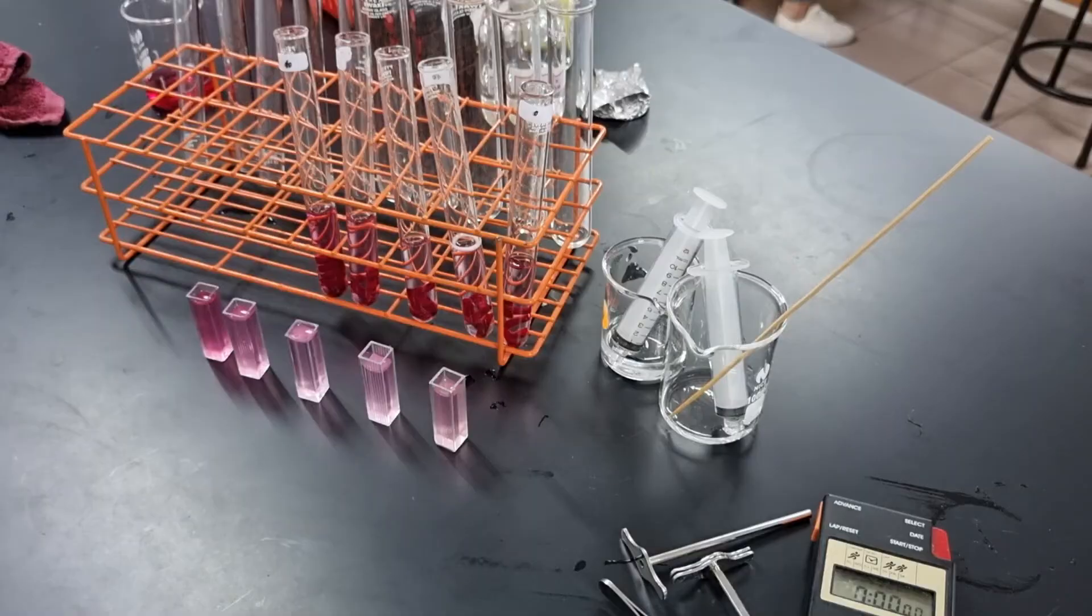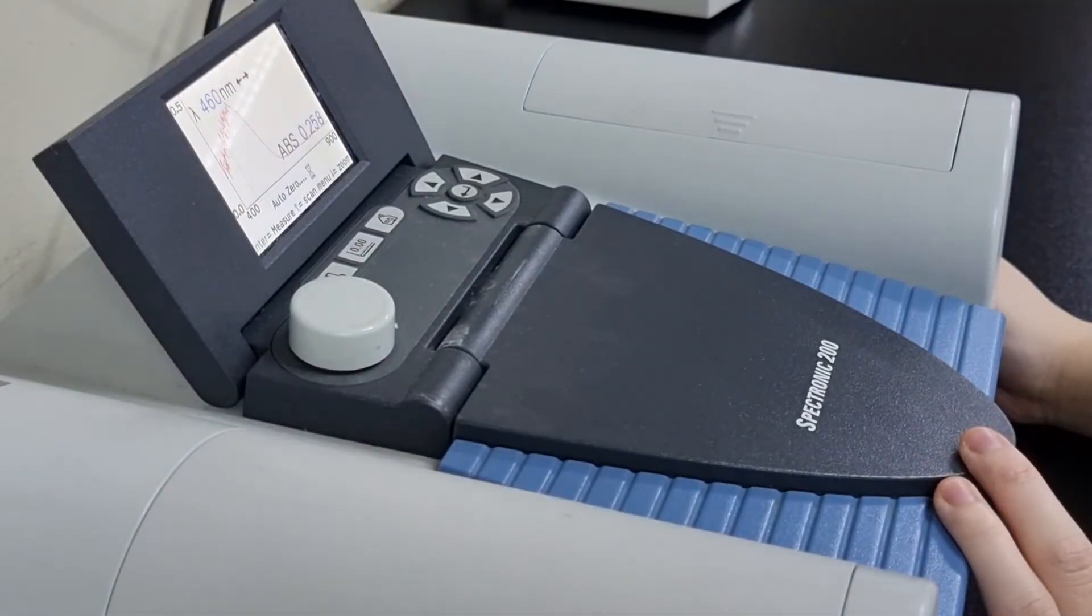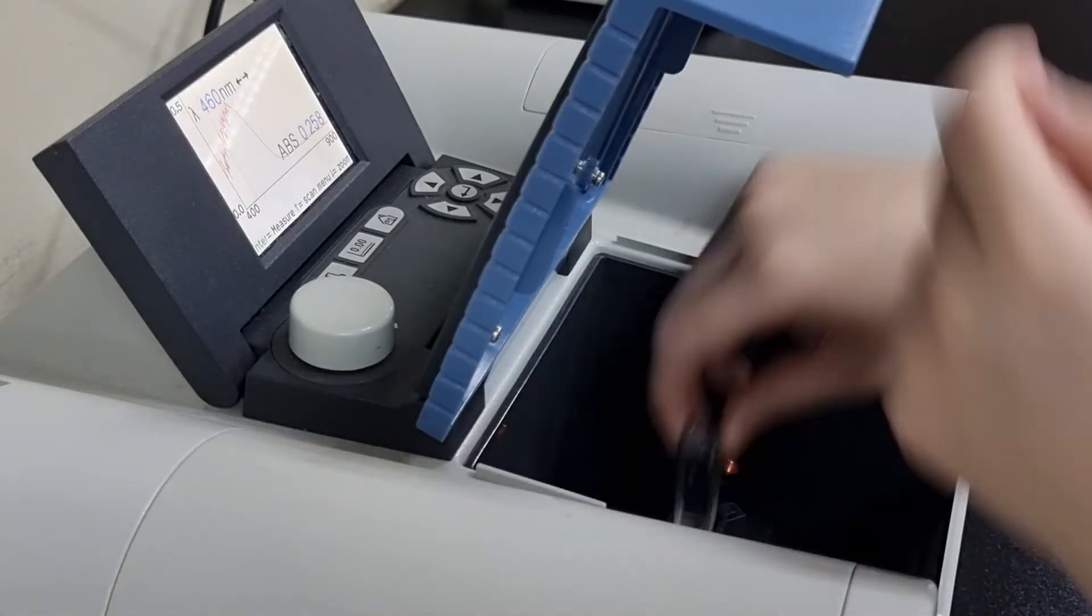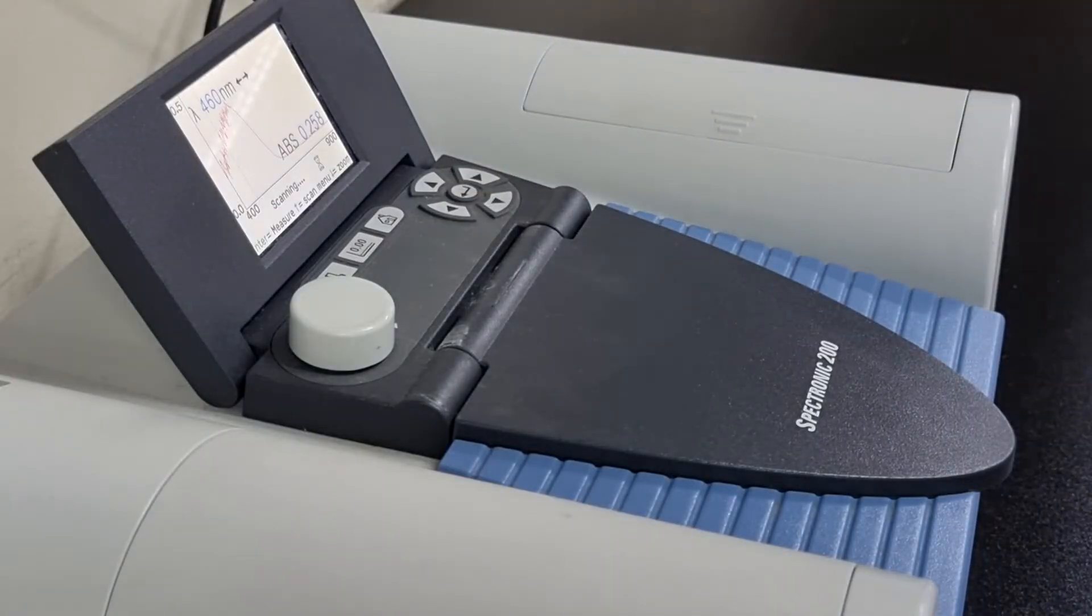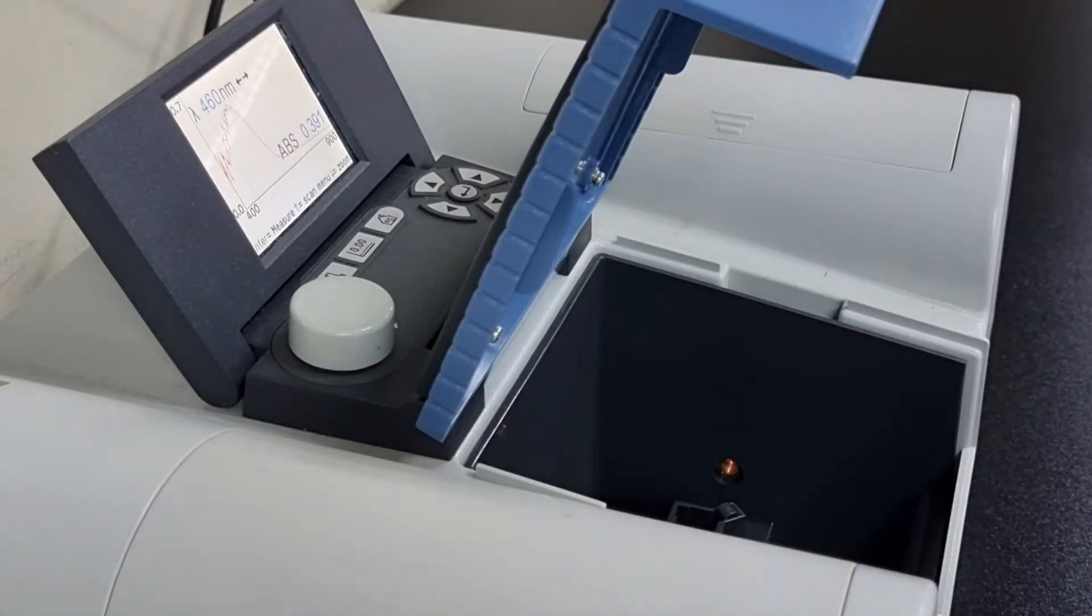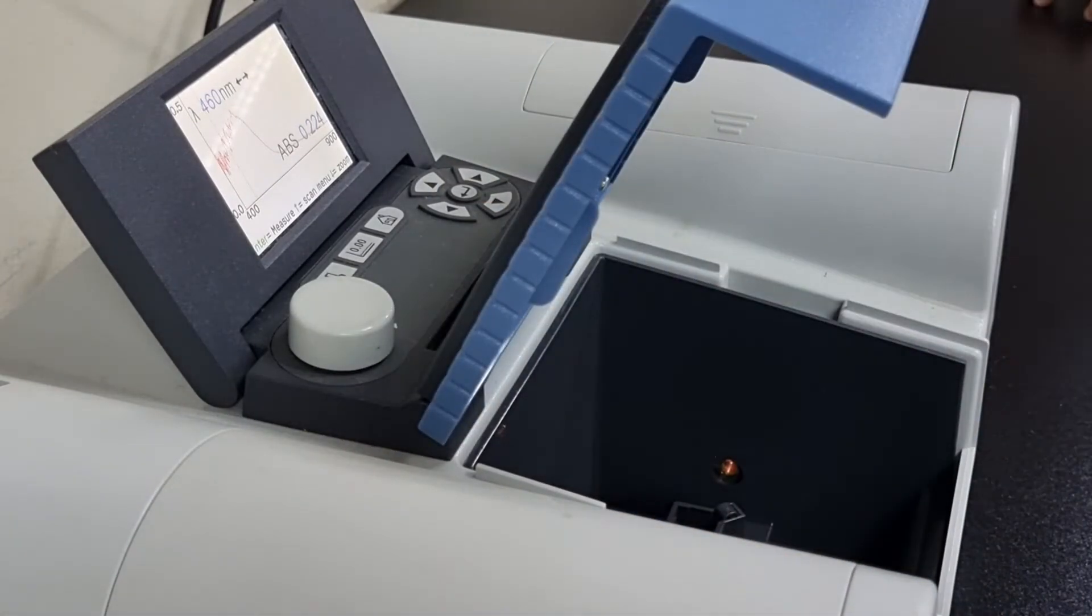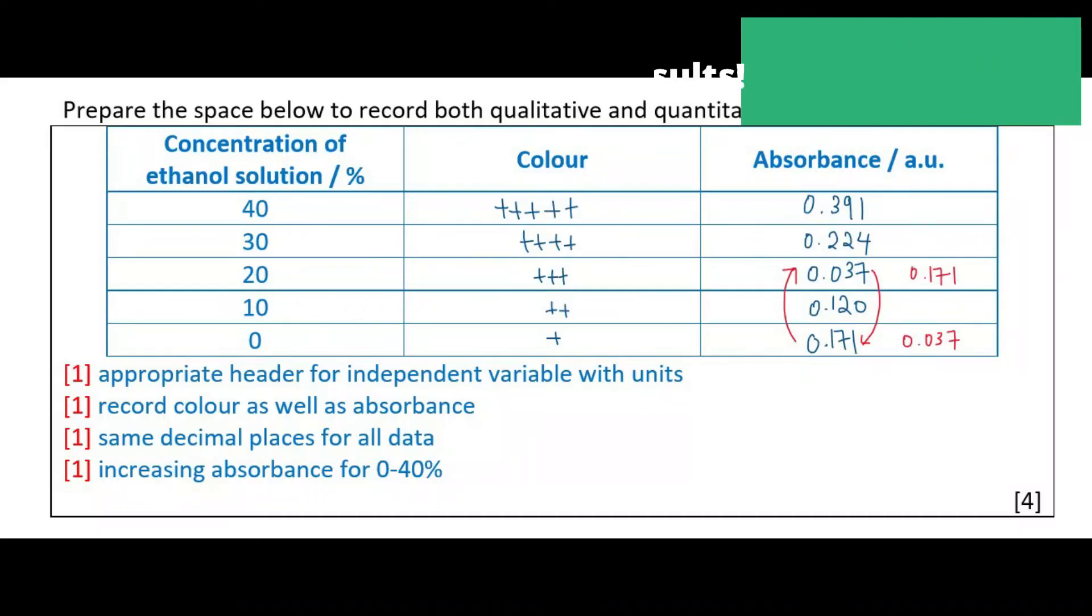Now with the spectrophotometer, we are going to blank it first or zero the spectrophotometer using a blank cuvette. This is just distilled water, set it to zero. And every cuvette we measure, every solution we measure, is going to have an absorbance as relative to the original distilled water cuvette, which is set at zero. So it's an arbitrary measurement. It's comparative. And this is the results I got.